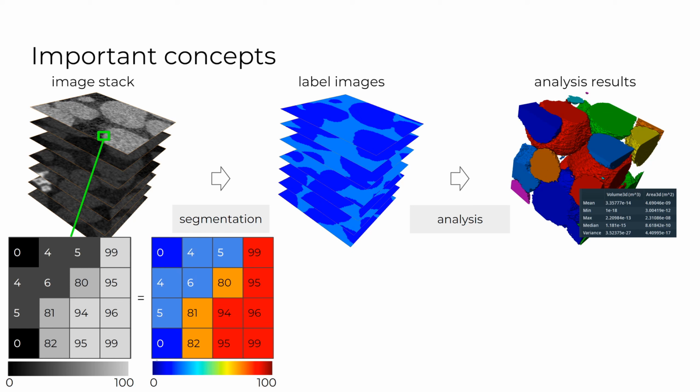So that would change the appearance of my image, but the underlying numbers are the same, okay? And we sometimes do this, like we change the color map to hide some things in the data or to emphasize some parts of the data, okay?